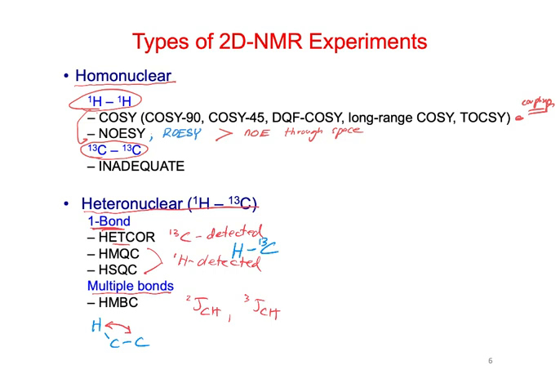The carbons must be C13, or doesn't matter? Well, for multiple bonds, it has to be a C13 here. It doesn't have to have all C13s, but just the one you're coupling to. So we know that there's a 1.1% chance that that peak will be C13. So this is J2.